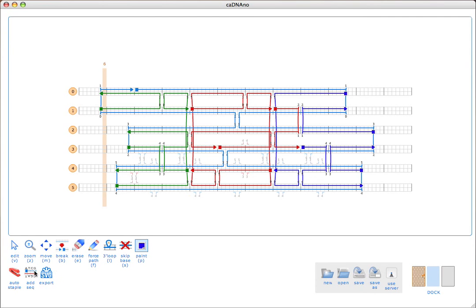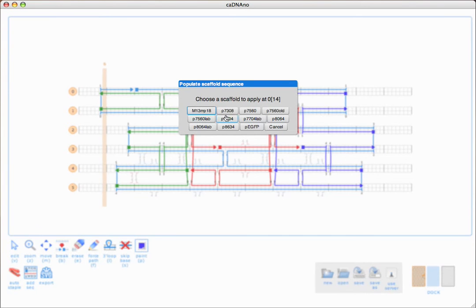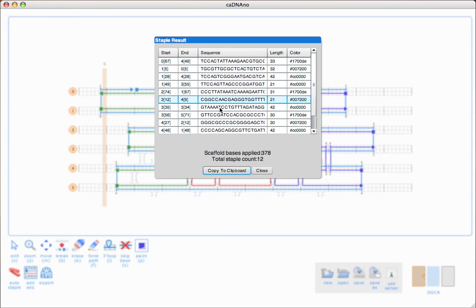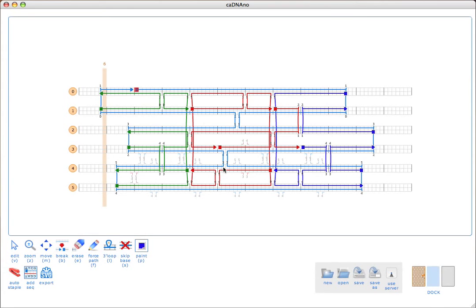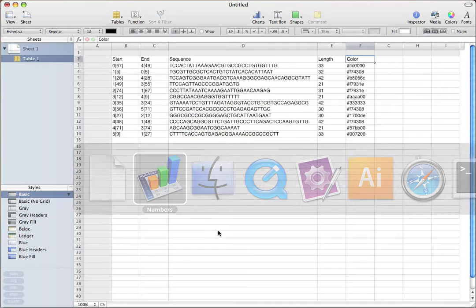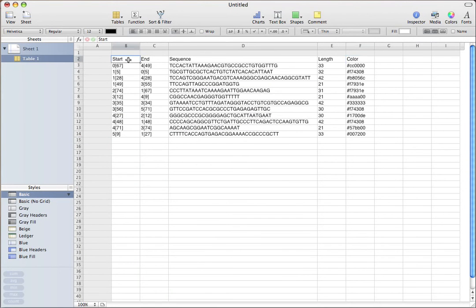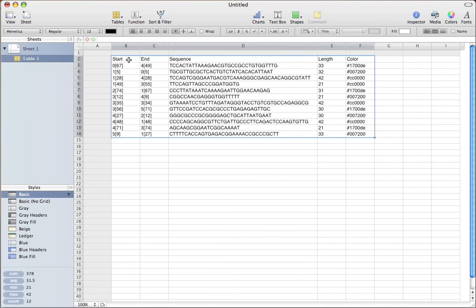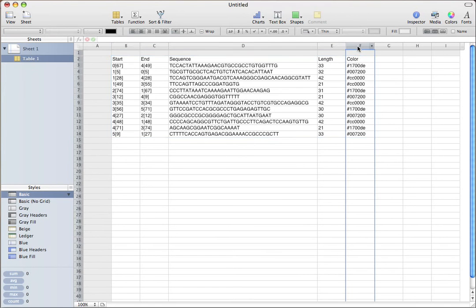I'll regenerate the staple sequences using the add sequence tool. Now we just get a different — basically the same staples, just with different color assignments. I'll copy those back to the clipboard, go back in here, and paste those. Now we see our colors have been updated.